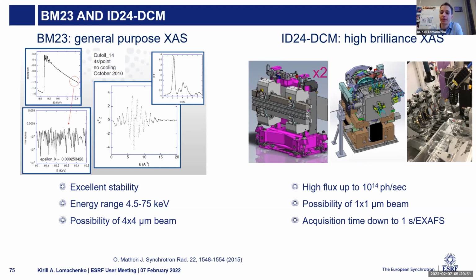This is a completely new beamline. It is built on the place of one of the hatches of old ID24, the energy dispersive ID24 that had two branches. Now only one branch will be kept energy dispersive for very fast experiments where you need to measure very fast with laser shocks with pulse magnetic fields.